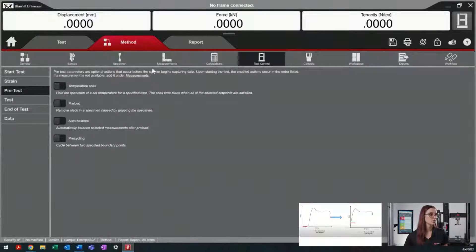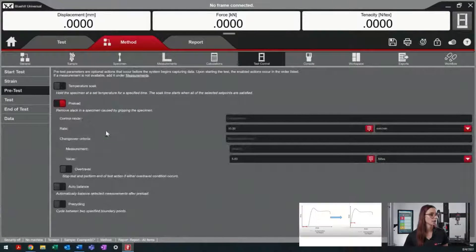So what is a preload? Preload is a zone in the test in which the crosshead will move to a desired measurement value to remove that slack. In this point in the test, there is no data being collected. If we go back into Blue Hill Universal, within the method tab, we can turn on our preload.